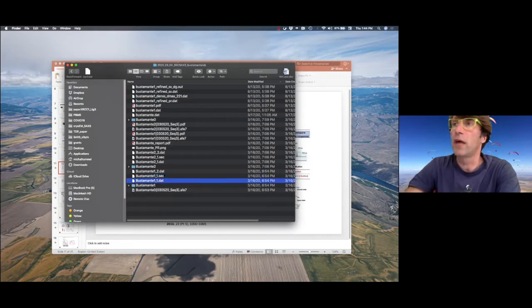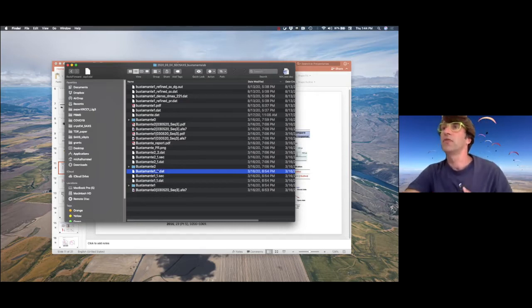But you also have, in this case, 2 data files for sample 1 and 2. Most likely these are peak front and back. I'm changing the names sometimes. But before you look at this report and at your data, the final merged .dat files, I highly recommend looking at the report for the MALS.